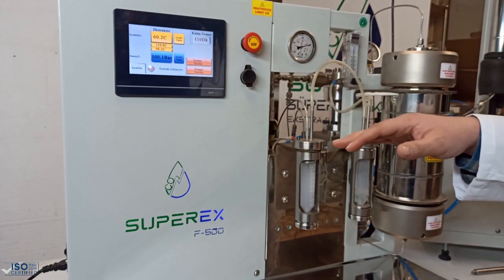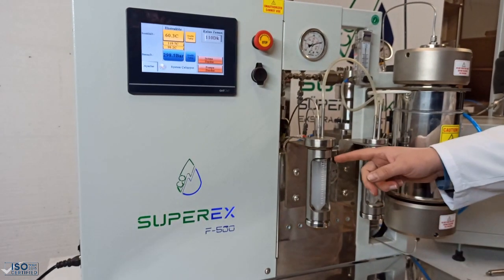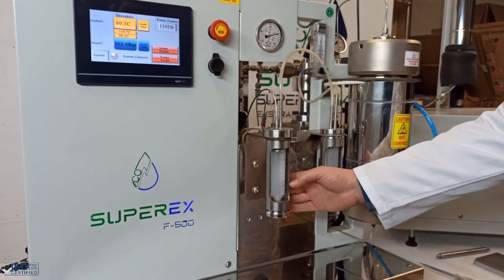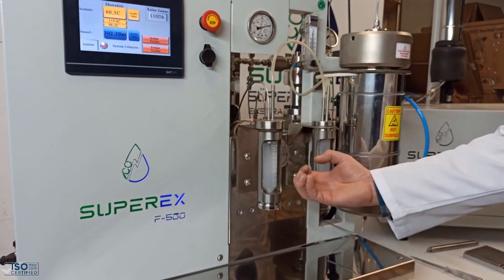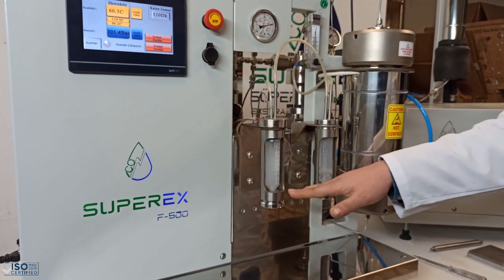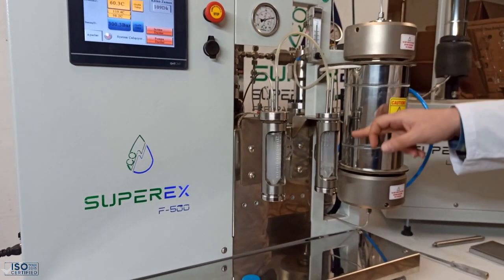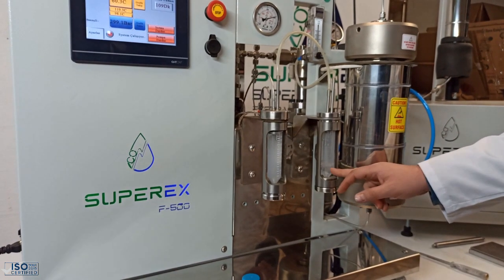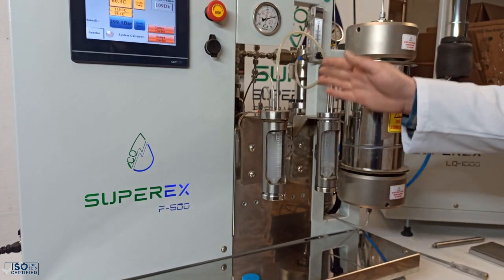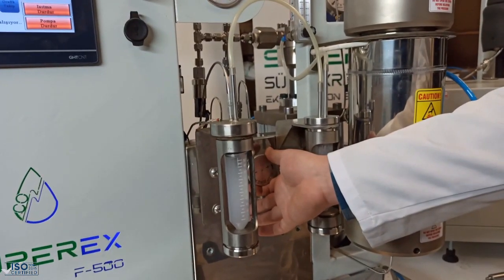The gas goes to the first stage separator — the falcon tube — where the extract drops to the bottom. The gas then goes to the liquid trap, and then to the flow meter to measure the flow, and finally to the atmosphere.